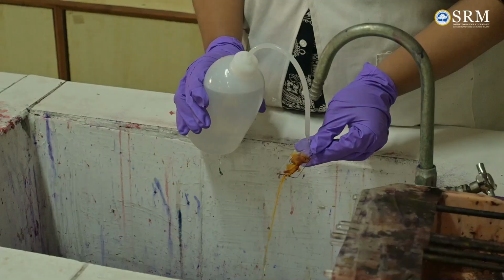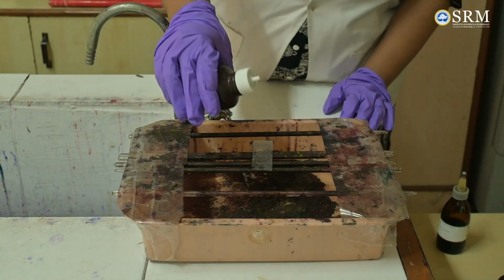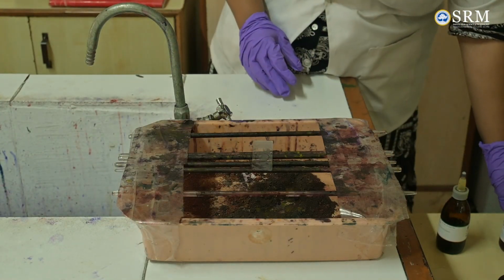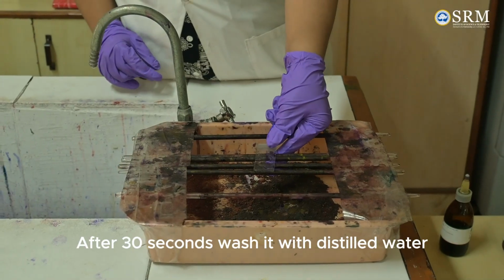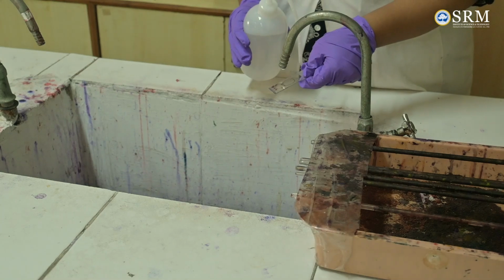And then we move forward to our third decolorizing agent, for which we use 95% ethyl alcohol. The alcohol is added to the smear dropwise. We wash it off with the distilled water to ensure even decolorizing.